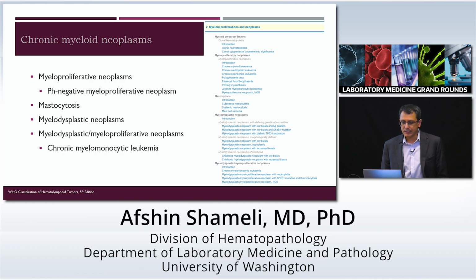And that's for different reasons. One reason is that for many of the myeloproliferative neoplasms, the clinical presentation as well as the genetic signature and bone marrow morphologic findings are generally straightforward, and many of these neoplasms do not require flow cytometry for diagnosis. On the other hand, in myelodysplastic neoplasms or MDS/MPN neoplasms, the application of flow cytometry is challenging because of the difficulty of panel development, standardization, and the fact that it requires complex interpretation. That's why the application of flow cytometry in these disorders is right now controversial, and many institutions do not perform it.